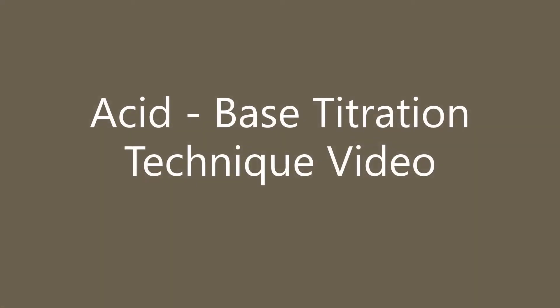A titration is a reaction that allows the chemist to precisely determine a quantitative measurement for a substance in solution. There are many different types of titrations, however the most common, and the one that this video will focus on, is an acid-base titration.